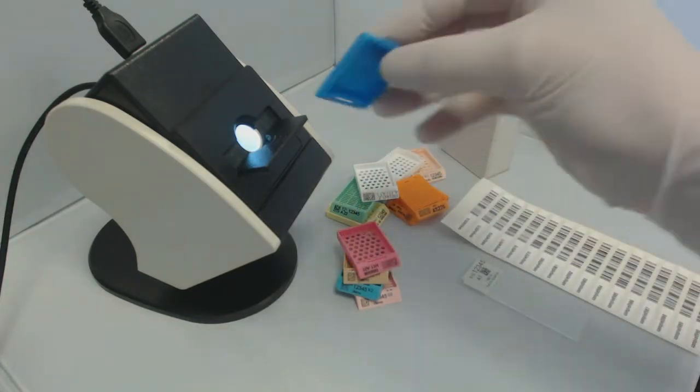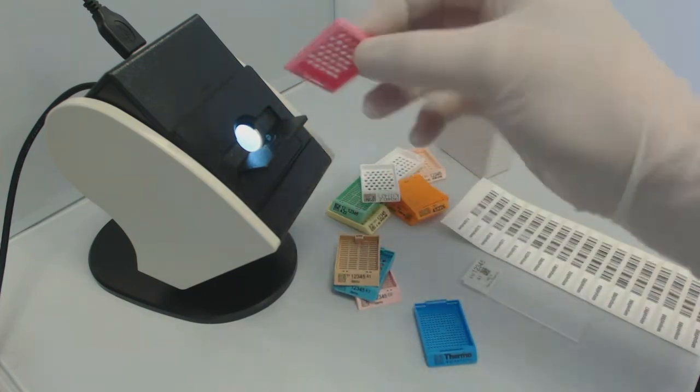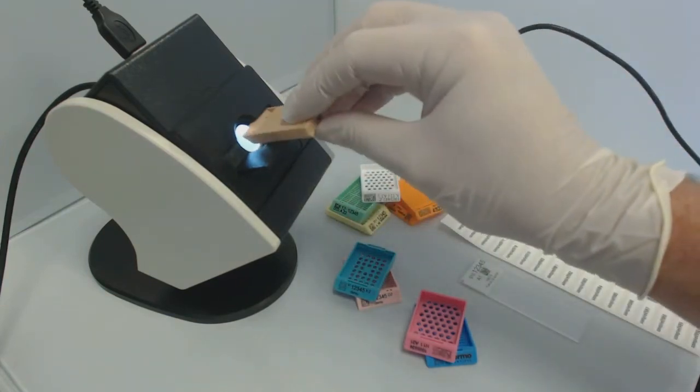Low contrast, poor prints, damage codes — conventional barcode scanners struggle to read, if at all. LabScan reads them all, every time.